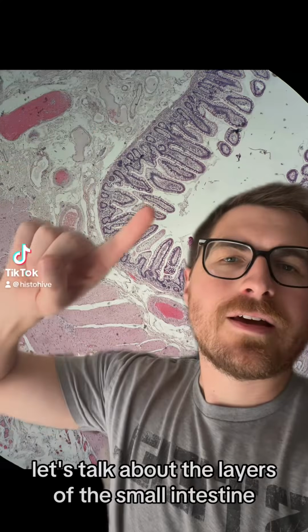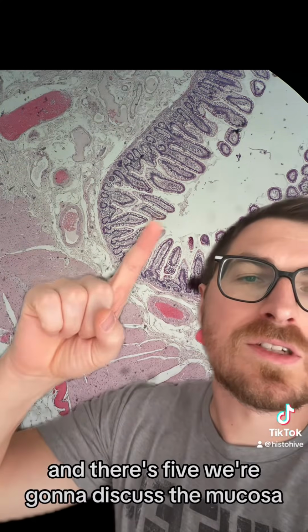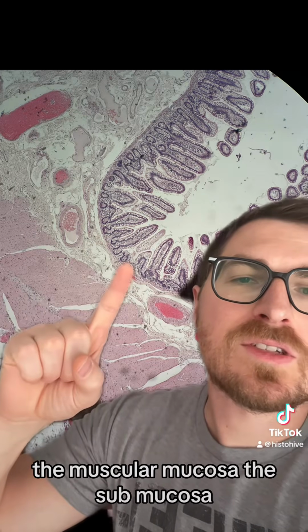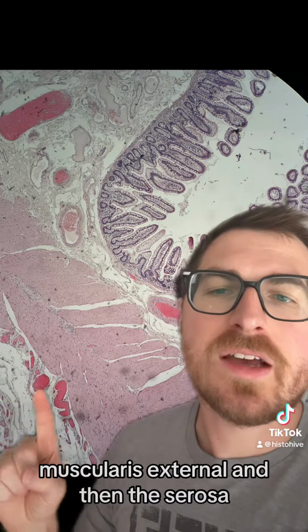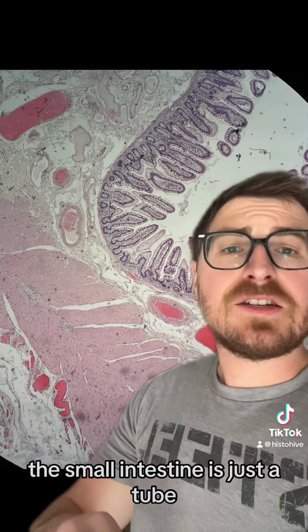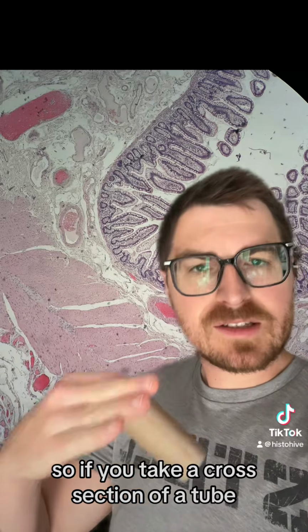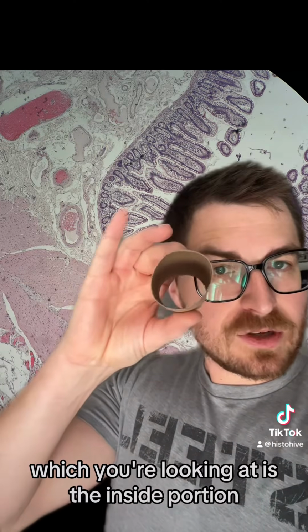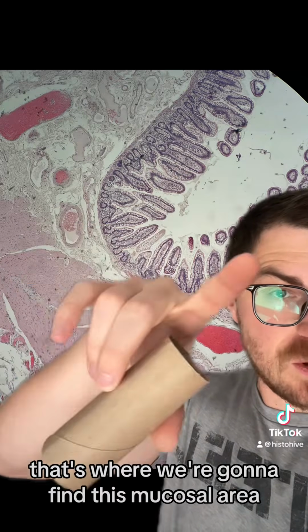Let's talk about the layers of the small intestine. There's 5 we're going to discuss: the mucosa, the muscularis mucosa, the submucosa, muscularis externa, and then the serosa. So the small intestine is just a tube. So what we're looking at is the inner portion. If you take a cross section of a tube, what you're looking at is the inside portion. That's where we're going to find this mucosal area.